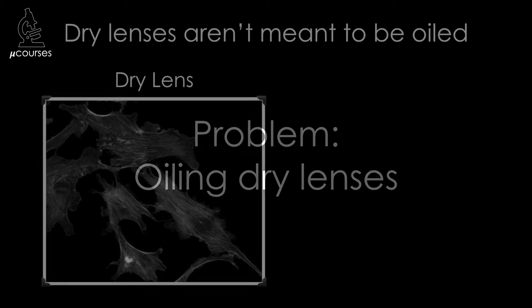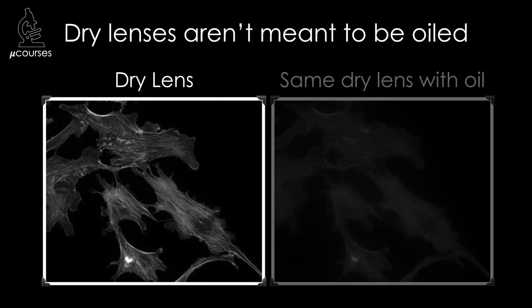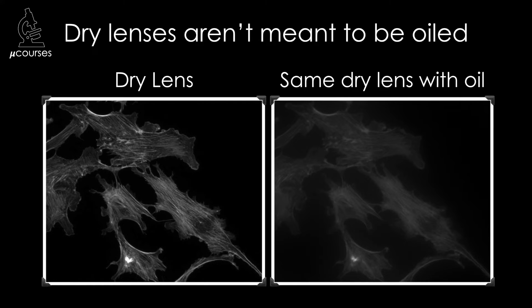I'm going to discuss three different problems with immersion oil. The first is when immersion oil is used with a lens that was designed to be used without any immersion media, which we call a dry lens. When an objective lens is designed, the optical engineer assumes that the lens will either be used dry or with a particular type of immersion media. So immersion oil is essential to an oil immersion lens, but it's detrimental to a dry lens.